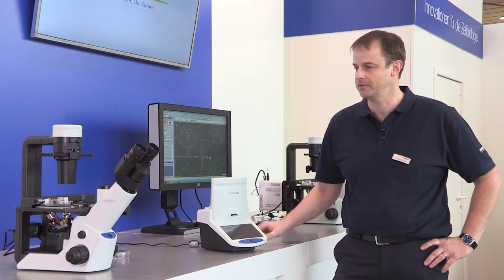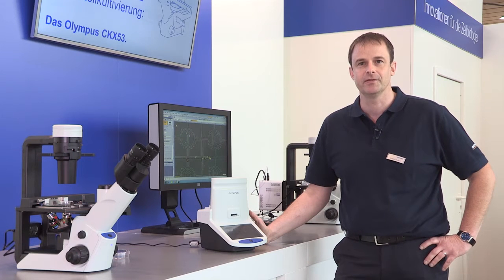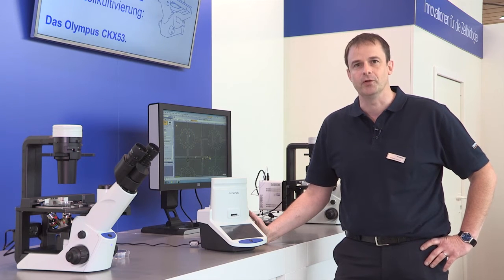Hello, my name is Wolfgang Hempel and I'm representing Olympus here at LabVolution in Hannover. This year we're very pleased to show for the first time to the public our new cell culture microscope, the CKX53, which we have on display here, but also our cell counting system, the model R1 from Olympus.